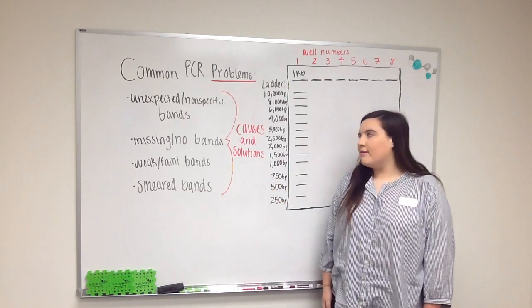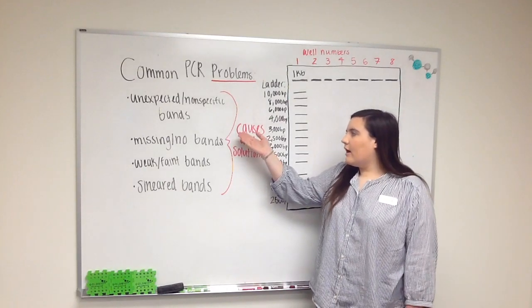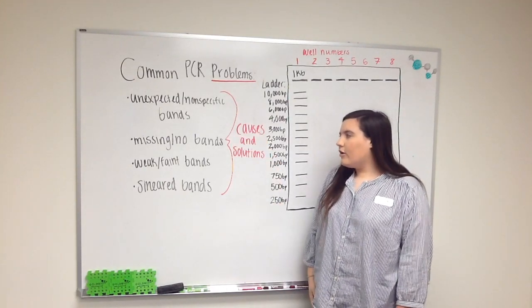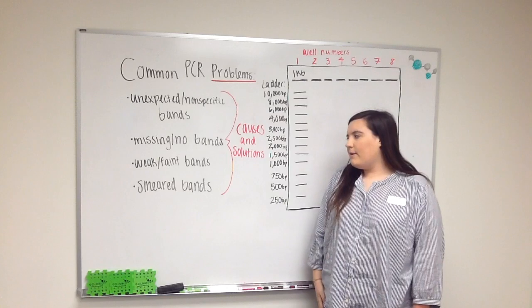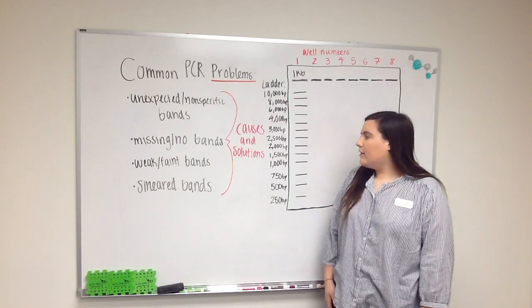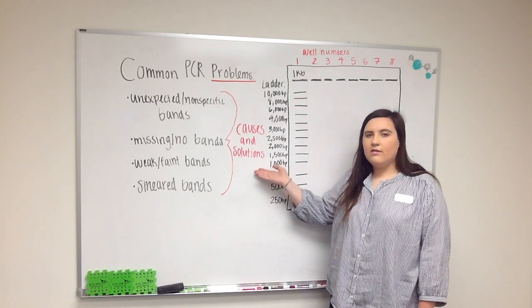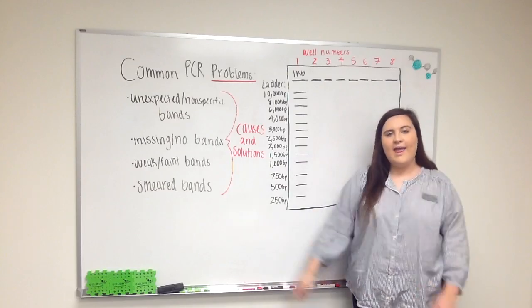The issues we're going to be discussing today are unexpected or non-specific bands, missing or no bands, weak or faint bands, and smeared bands. We're going to be discussing the causes and the solutions of these problems. Let's go ahead and get started.